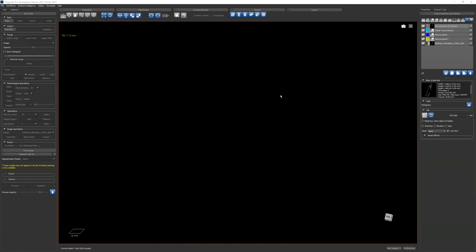You can see that this looks like you have gray values, you have black, a spectrum of gray. So you're good. That's what you need. If this were wrong, all this would be white and this would be black, and it'd just be black and white.